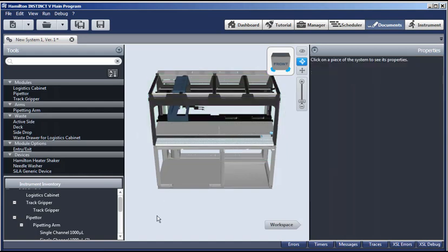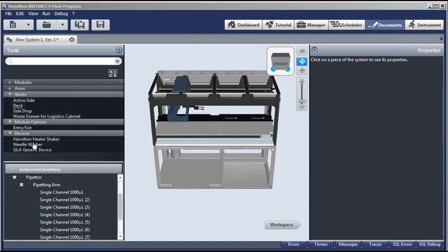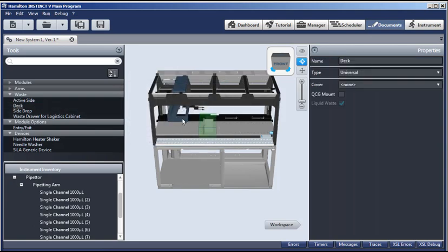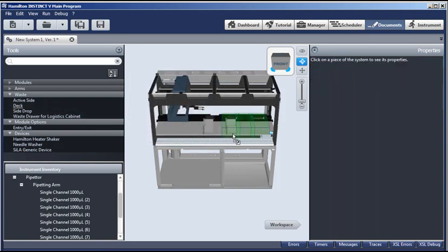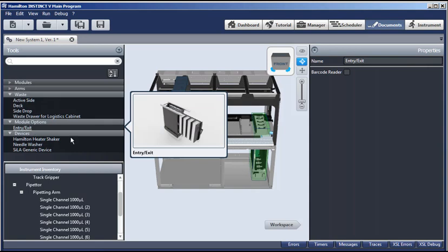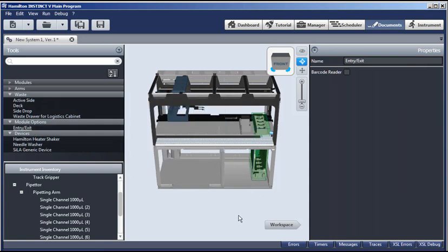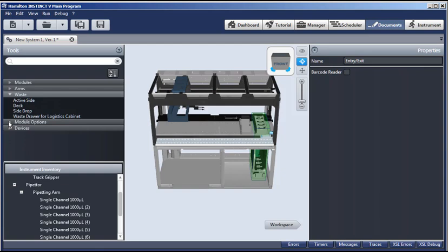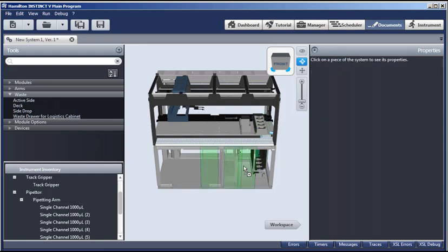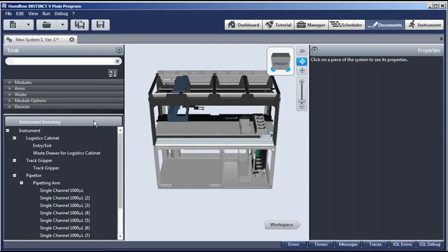Now let's finish our instrument configuration. Let's add a waste chute to our deck. So double-click. And wherever you see it, you can change the location by simply moving it over. Now it's here. Let's add an entry exit. Double-click, and it will appear in the default location over here. So we have our entry exit. We have our waste. And along with our waste, we're going to add a waste drawer right below it. And this way our tips can be ejected, and they'll go into the waste drawer. And now that we have defined our instrument configuration, that is our hardware, we can go to the workspace and set up the labware to complete our system document.